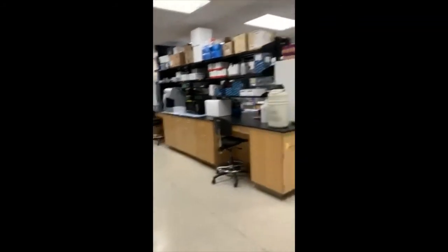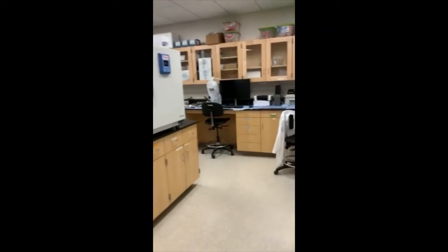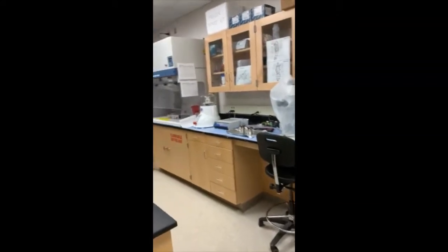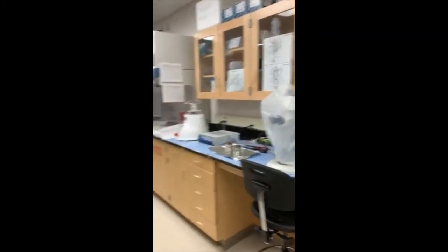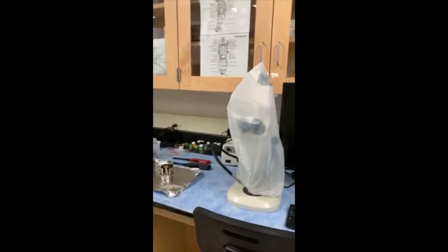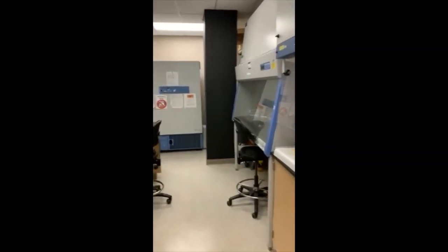Hey guys, welcome to the Sing Lab. So the Sing Lab is a molecular research lab here at VCU, but instead of looking at human DNA evidence like what is classically associated with forensic science, we are actually here to investigate the insects and the microbes associated with crime scenes. So you can see we have a pretty traditional DNA extraction setup. We have a couple of flow hoods here. We also have stations set up that are going to allow us to identify those forensically relevant insects.